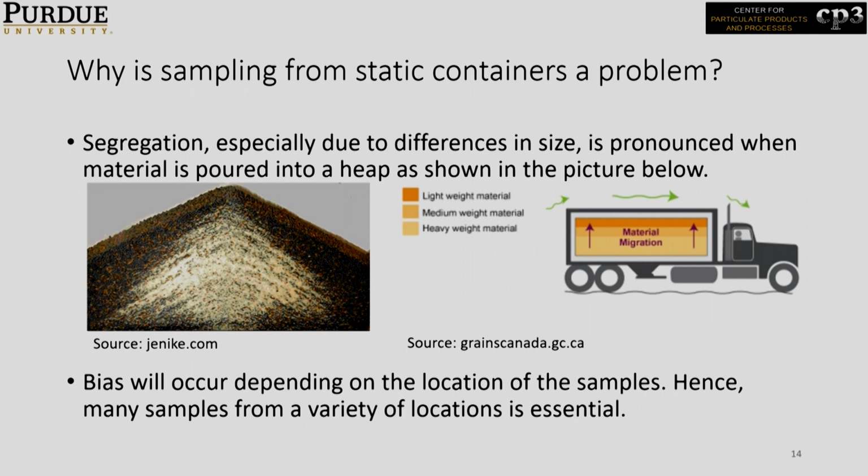If you are taking a sample from the surface, for example scooping from the surface, you are not gathering the powder from inside. So you are getting a segregated bulk, and that should be avoided. The same thing applies when you are transporting bulk material in trucks and containers. Usually, lighter material comes to the top. Do you know the name of that effect?